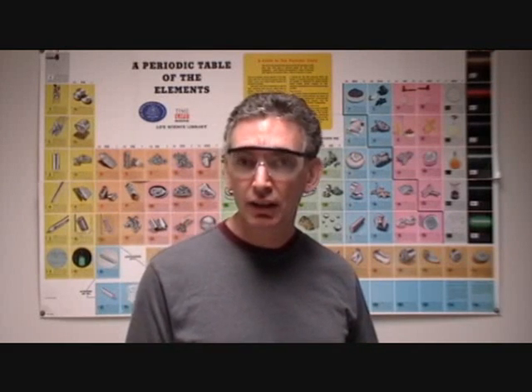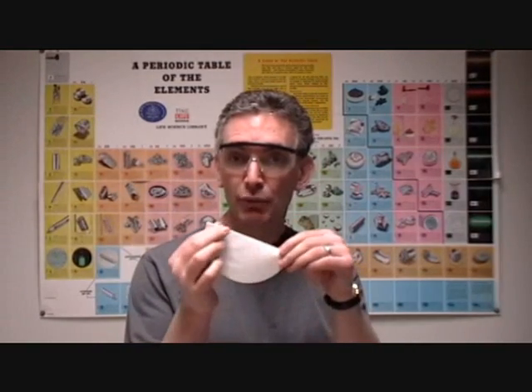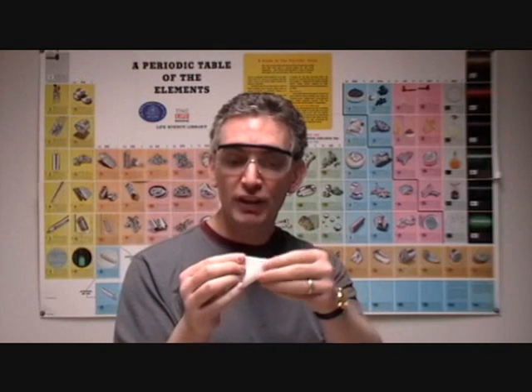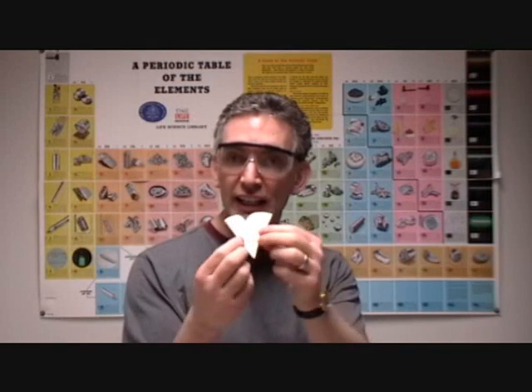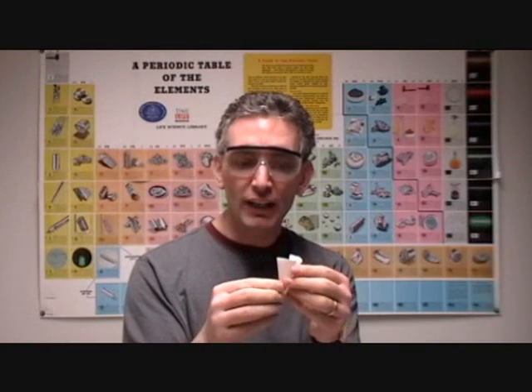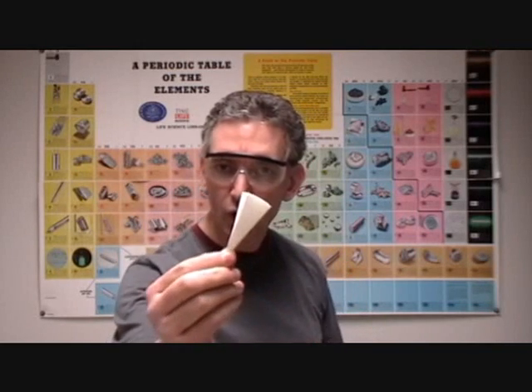When you are ready to separate the salt water from the sand, take a reserve filter paper, fold it in half and press down. Fold it a second time into a quarter, then fold a third time into one eighth. Then take each half of the filter paper and fold each half down and back on itself. Press down firmly on this reduced structure.